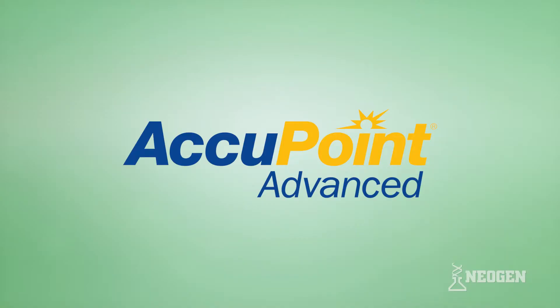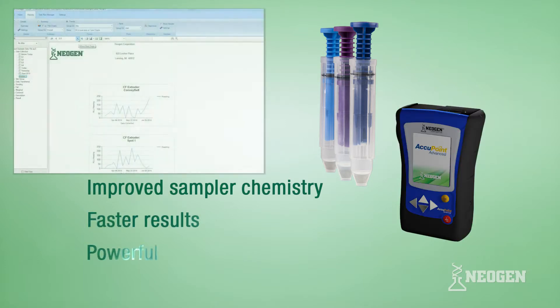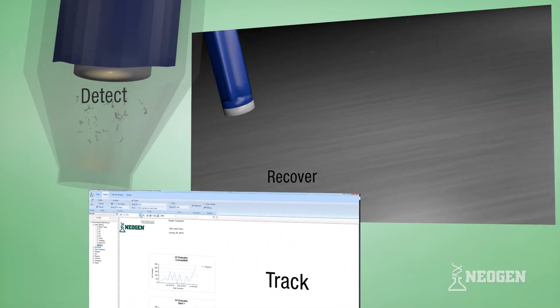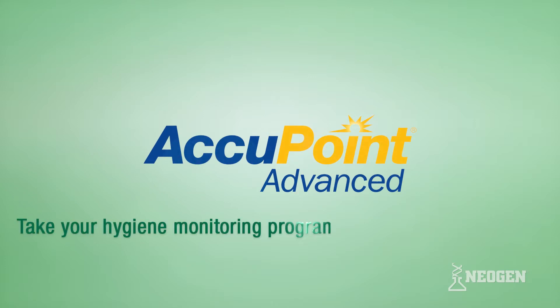The Accupoint Advanced system, with improved sampler chemistry, faster results, and powerful software is the best system to recover, detect, and track ATP levels. Neogen's Accupoint Advanced system, take your hygiene monitoring program to a new level of clean.